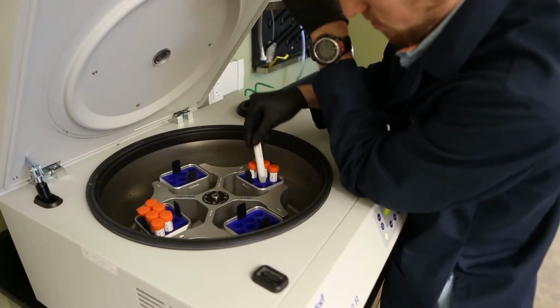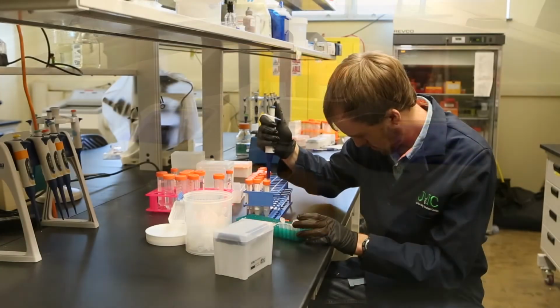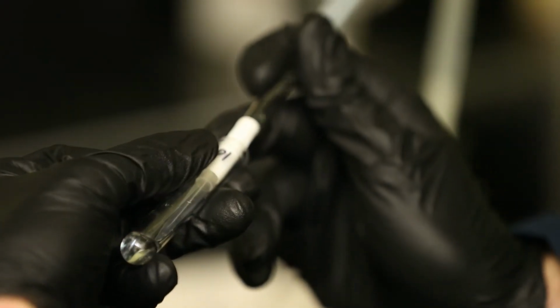And then what we'll do with those is we have to actually work them up. That means we have to record the volume, record how much protein is in it, log all that information and standardize it. One of the recent experiments that we were just working on, we generated almost 14,000 pieces of data just from the saliva samples that we obtained.